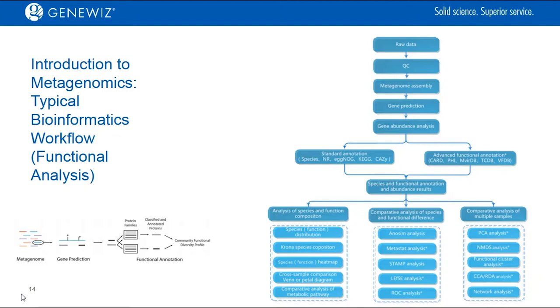To the right, you can see a more detailed workflow, including the typical QC step. Don't forget to remove host reads if need be. I've seen better results doing de novo assembly than direct alignment of reads to a database of known genes, so I'd recommend doing assembly for functional analysis, then revising your assembly, and don't forget to consider that this step will produce chimeric reads that we need to filter. So then we do the gene prediction by aligning to a database of known genes, and we cluster these genes into gene catalogs, which will then be annotated against databases like KEGG or eggNOG.